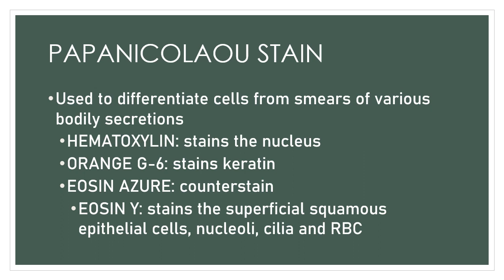And so you're using eosin Y, and it stains the superficial squamous epithelial cells, the nucleoli, the cilia, and the RBC. So your eosin Y stains the superficial squamous epithelial cells, nucleoli, your cilia, and the RBC. Okay, and so that is for your Papanicolaou.